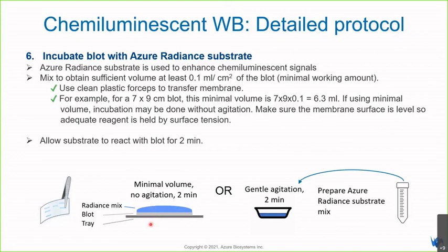Same thing if you are not using the minimal working amount. This is for minimal volume. If you're using a lot more volume, you can put it in the tray and then incubate for 2 minutes with gentle agitation. Allow the substrate to react with the blot for 2 minutes.